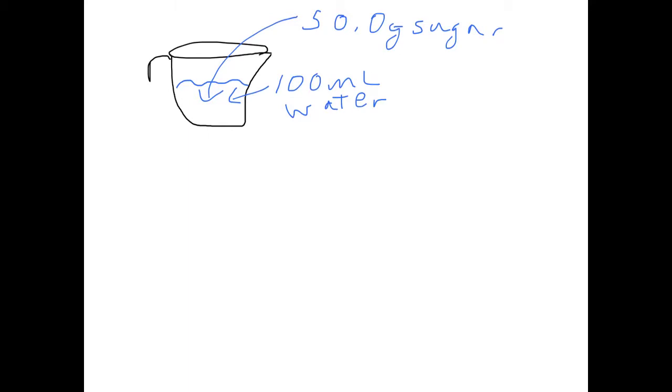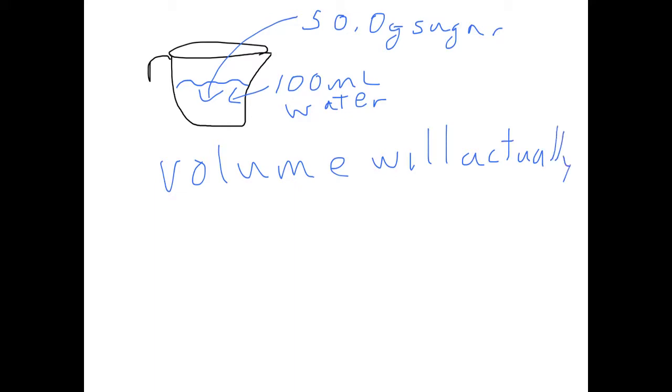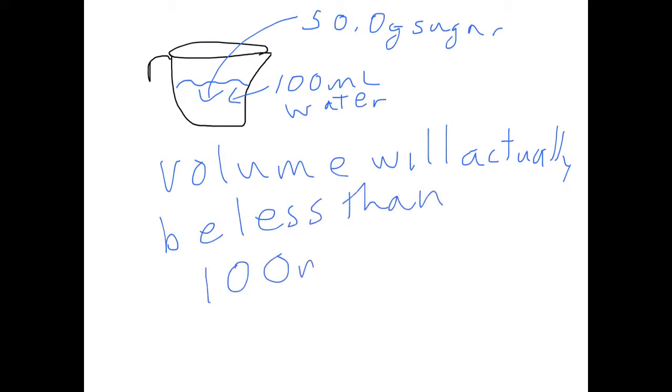If you get that 50 grams of sugar into that 100 grams of water and then read the volume, you'll notice something really, really cool. You'll notice that the volume of your solution will actually be less than 100 milliliters.